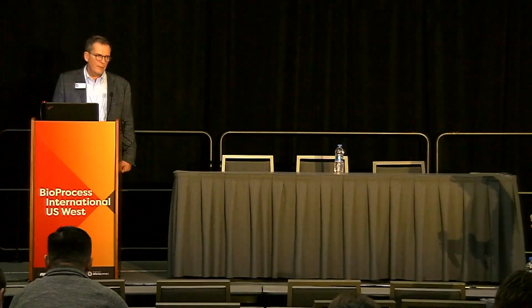Yeah, I was wondering what the calibration process is like, and then if there's a generic process to go with the product. Yeah, great question. What we're doing is we are calibrating everything to the NIST mAbs currently right now. And mind you, we have focused only on monoclonal antibodies currently. We're a small company, and if you go too many ways, you diffuse yourself, and you never get anywhere. So right now we're using that for all of our standard and calibration kits. As a matter of fact, we give the calibration in kit form, so that you can use your own NIST standard. You don't have to buy them from us. We'll be happy to put them in the kit if you would like them. So yeah, that's your starting point for your process.